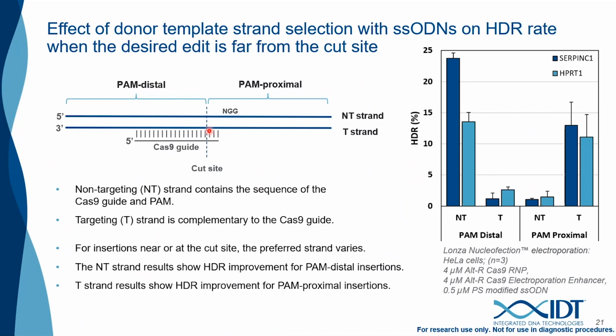However, if you are outside of that recommended 10 to 15 base pair window, it really matters which side of the cut site you're on relative to the PAM.